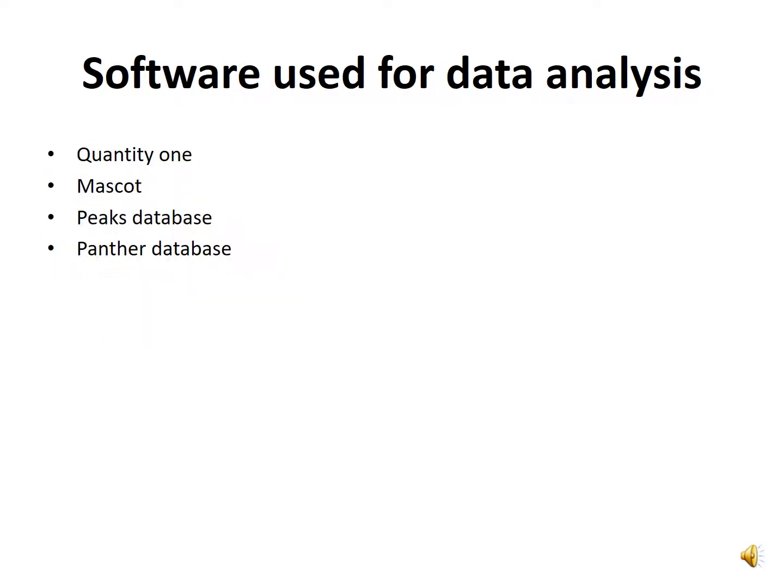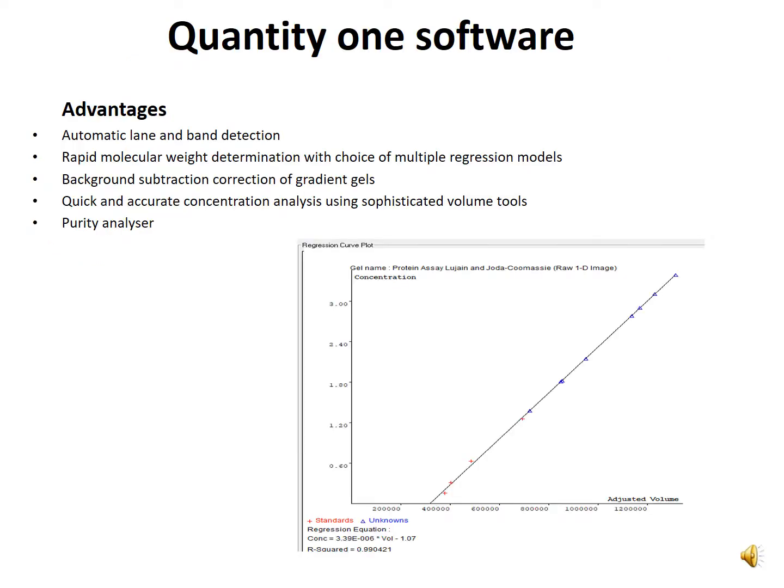Here is the software we used for data analysis. They are Quantity One, Mascot, PEAKS Studio, and Panther database. I want to talk about Quantity One software. Here are the advantages of using this software.